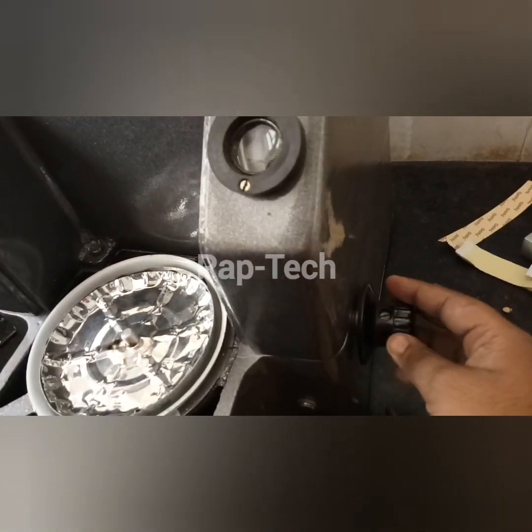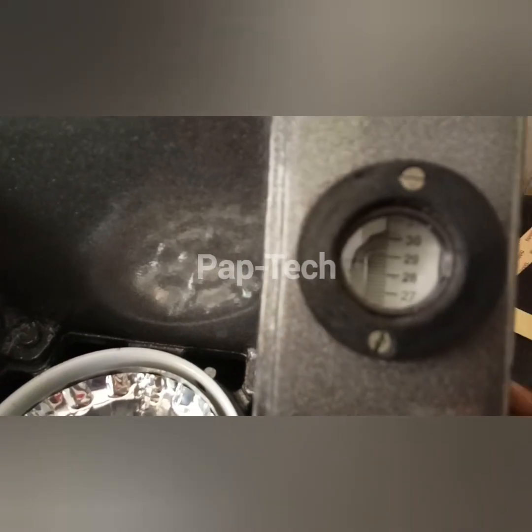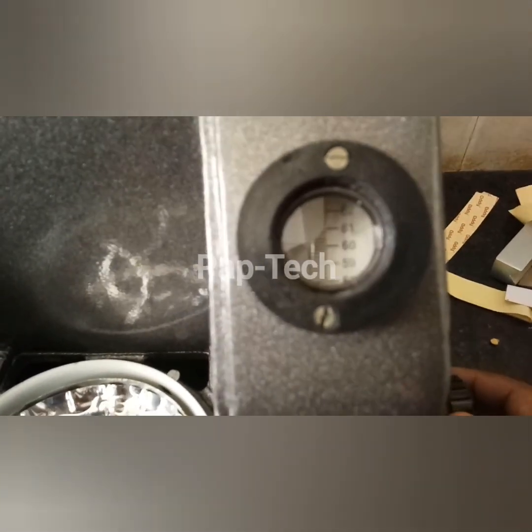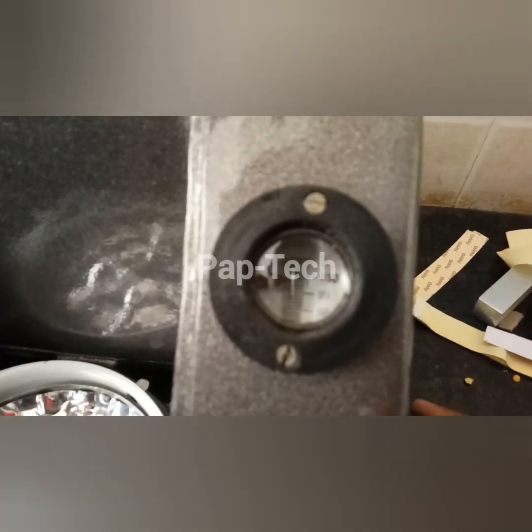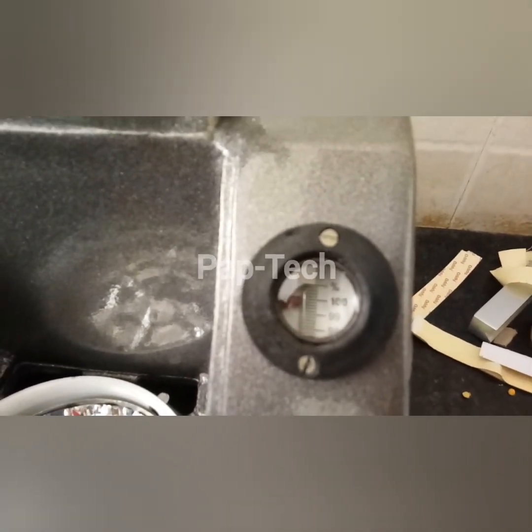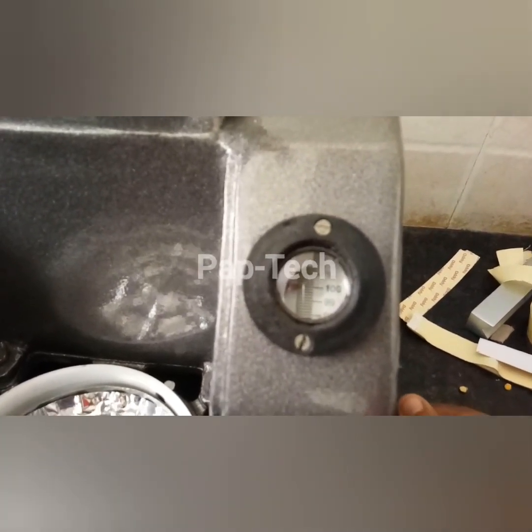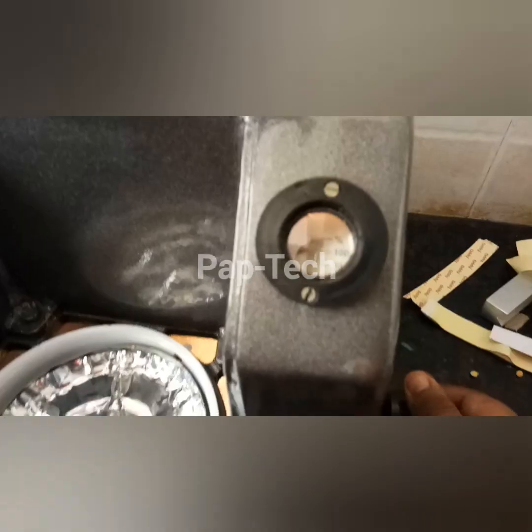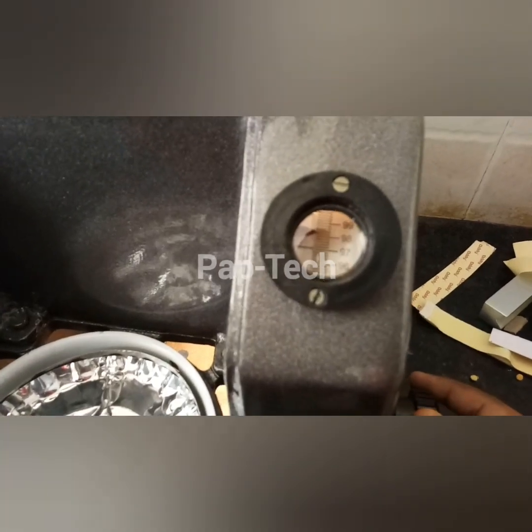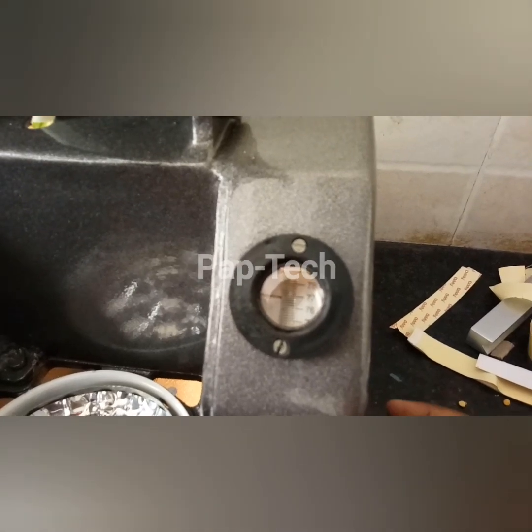First of all, we have to set this scale to 100 percent. As you can see, this is at 100 percent and we have set the value. Now we have to bring this to zero value, as we have calibrated its moisture content.